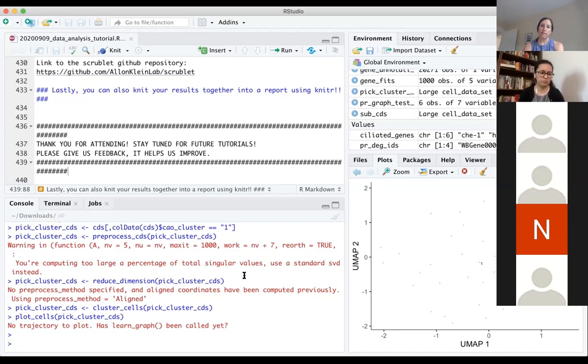Another thing would be, so your question is, how do you improve the resolution and make it cluster better? Yeah, if possible. Yeah, so that's sort of a trial and error method. One thing is you can use the K and the resolution parameter and try different combinations of it to see if your clustering gets better.